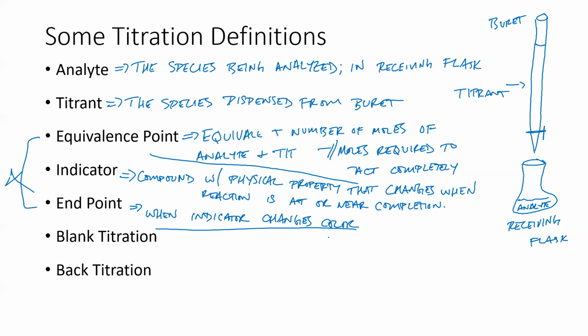We want to make sure that as we do the titration, if we're using DI water, maybe its pH is not exactly 7, and so some of our base has to react with carbonic acid that's dissolved in the water to make it neutral. And we want to know how much base that requires, right? Maybe our indicator requires a tiny, tiny bit of base in order to do that color change. And we want to know how much that requires, especially in an analytical situation.